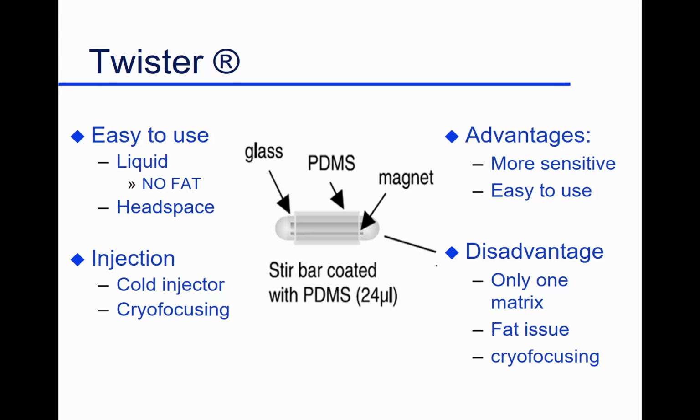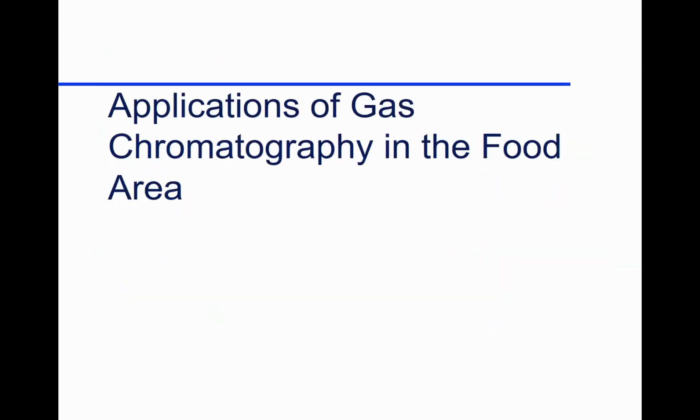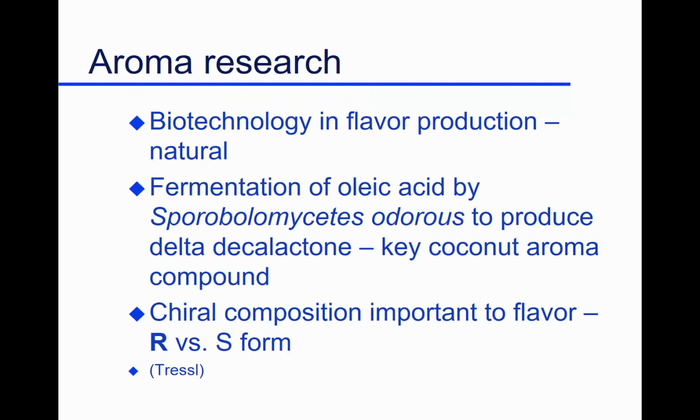So again, we've just got many ways we try to concentrate gas samples, or do extractions of liquid samples, solvent extractions, whatever, to get that in a form that we can do analysis on. There are a couple of examples we'll look at in terms of applications.